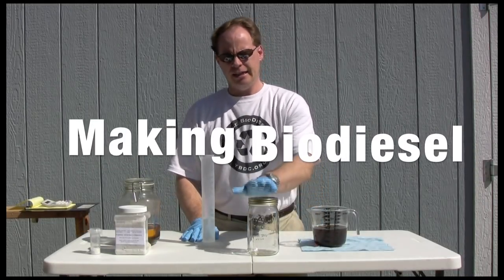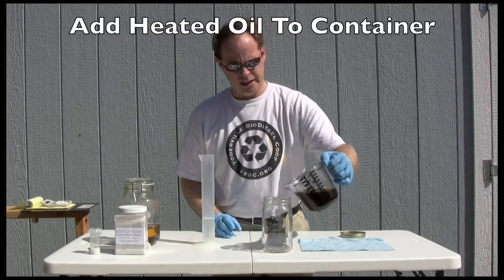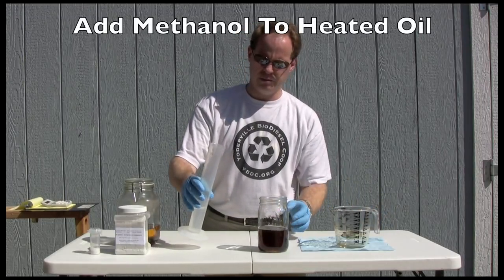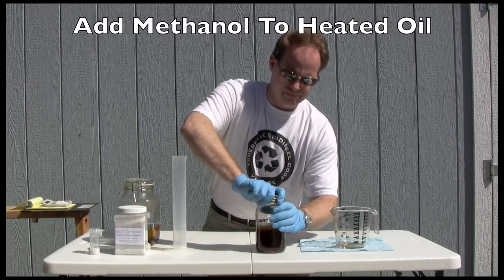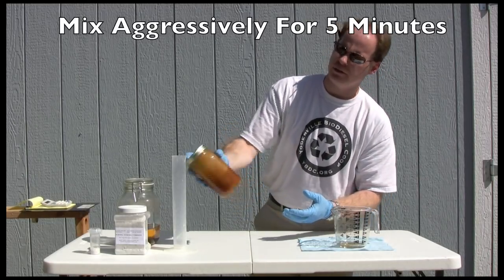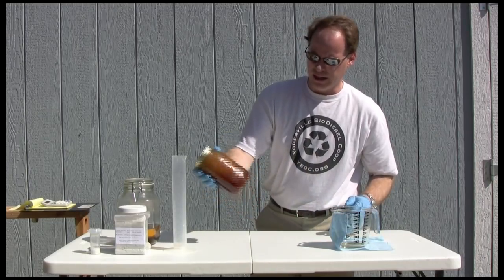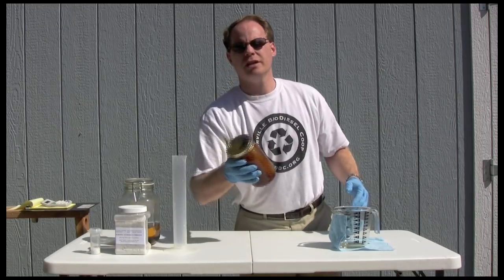With our catalyst dissolved, it's now time to make biodiesel. I like to use small mason jars because they're easy to pour into, we can seal them, and we can shake it up. I'm going to take the lid off, pour my oil in — beautiful golden brown color — and then take my 80 milliliters of methanol and potassium hydroxide and put that in. As I begin shaking this, the color is going to change almost immediately. We've just turned to this nice caramel looking color, and that's normal because that means the reaction is occurring. I can feel it in my hand getting warm too. I'm going to shake this for about five minutes.